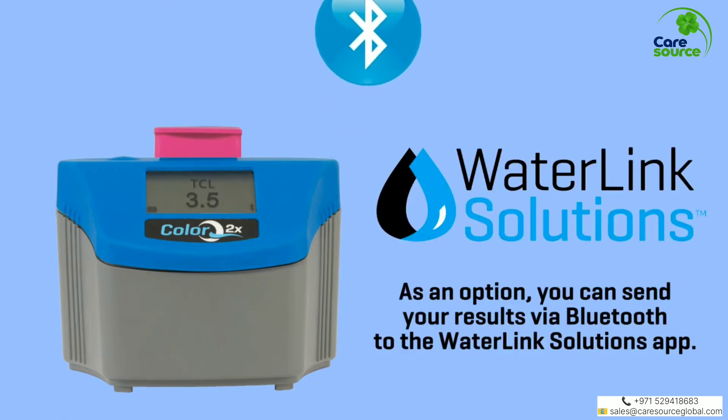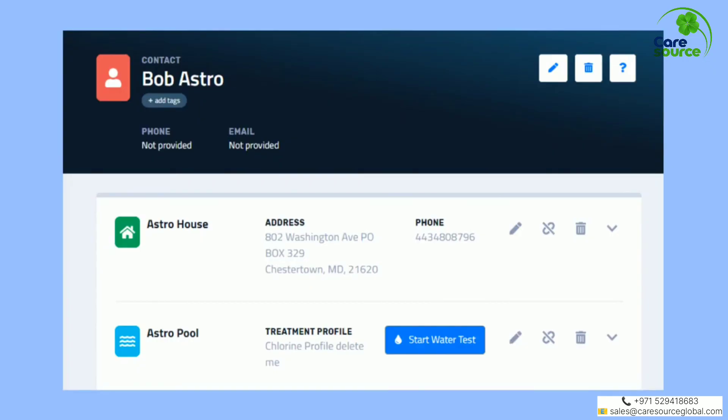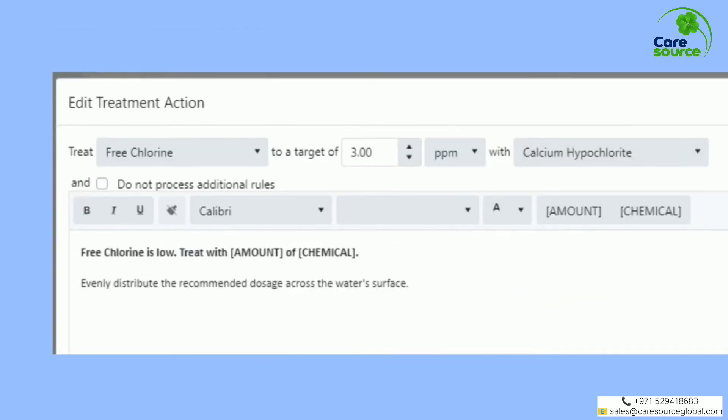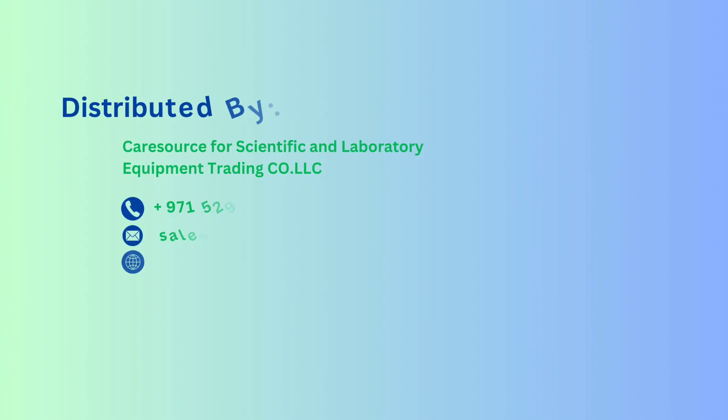As an option, you can send your results via Bluetooth to the WaterLink Solutions App. Manage records, store and transfer test results, build treatment recommendations, and download the results.